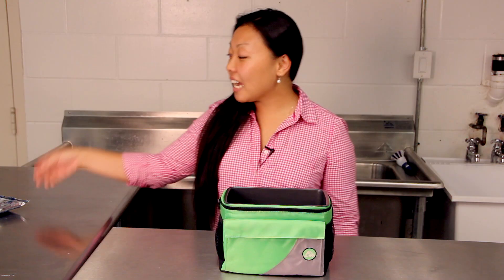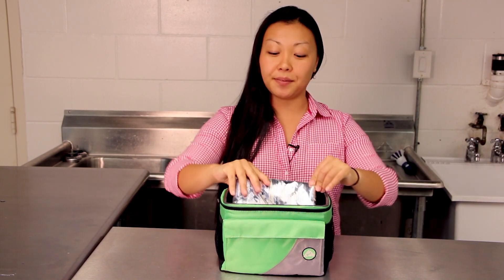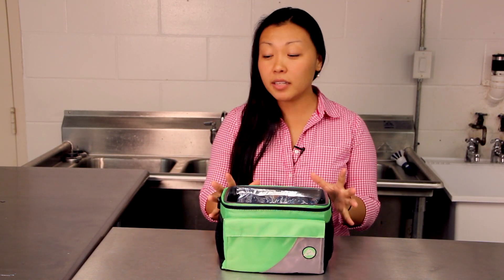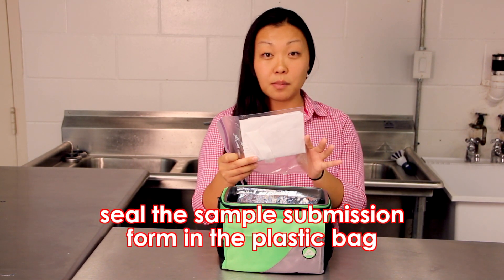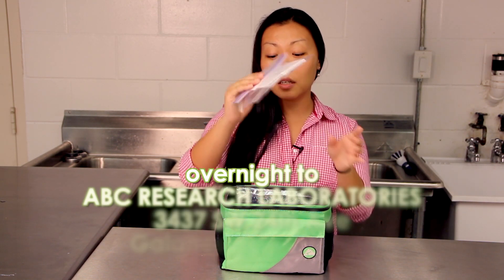Put the water sample in — you'll notice how it's layered. Next, top your water sample with another freezy pack as your third layer, which will help it stay cold. Your final layer is going to be your sample submission form. The Ziploc bag will keep your sample submission form dry. It's very important that you fill out the sample submission form correctly. Go ahead and layer it in and zip it right up.